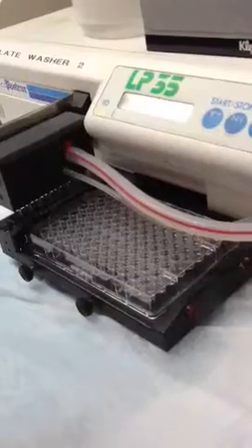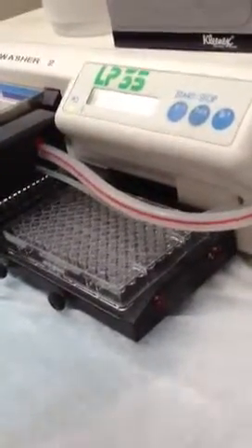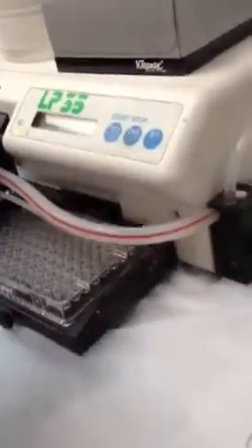Obviously the longer you leave it, the more you waste. We also give it a rinse cycle when you actually start the buffer — you've got to basically prime the line. Because otherwise you've got water — you're just going to put water through the ELISA assay.